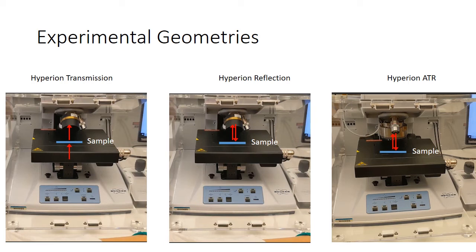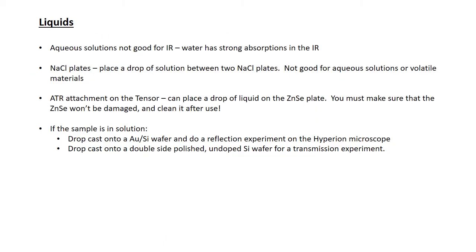And you may be starting to think now about your particular sample and what's going to work best for your sample. Now let's talk a little bit about different types of samples and how we can run them and how we can prepare them for analysis.